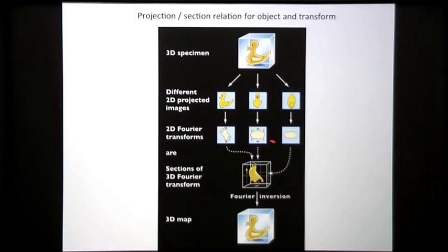then you can split these two-dimensional projections down into their two-dimensional Fourier transforms like this. And then, remarkably, these two-dimensional transforms of projections correspond to the corresponding central sections through the three-dimensional transform of the three-dimensional duck, if you could have got that directly. You can't, because you've only collected two-dimensional images. However, you can build up the three-dimensional transform a section at a time, by including different views of the duck. And when you've filled in the three-dimensional transform, you can do a Fourier synthesis, you add all the waves together, and you recreate a three-dimensional map of the duck.